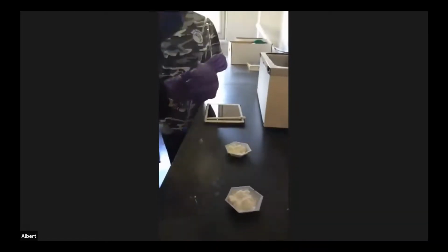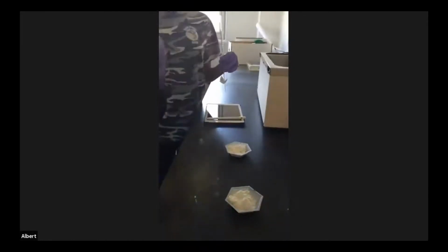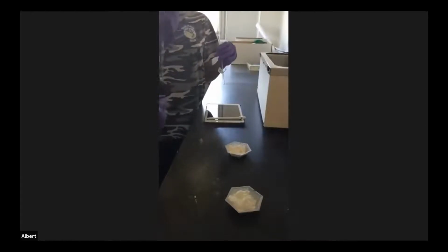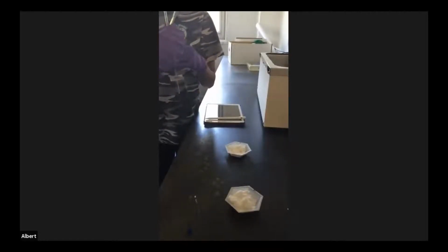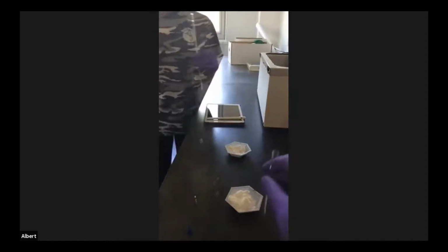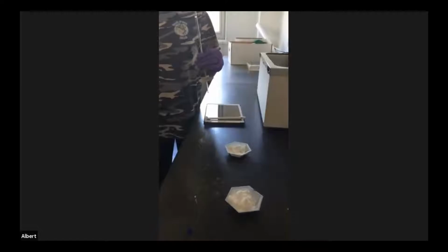If they're really clean, you're not going to see any salicylic acid left over in there, or acetic anhydride. Take the top off the bottom. Be gentle here, because those tubes are fragile. And then I'm going to set up sample 3. It's going to take a little bit of 3. Not that much.